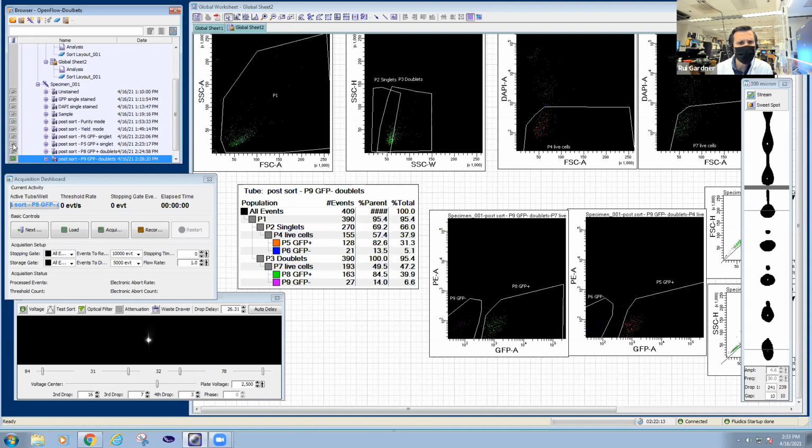So again, this is similar to this one here, where we were still seeing a lot of positives. So something to take into consideration. I would be tempted here to check the AccuDrop, although it seems that when we sorted the positive, it worked pretty well.